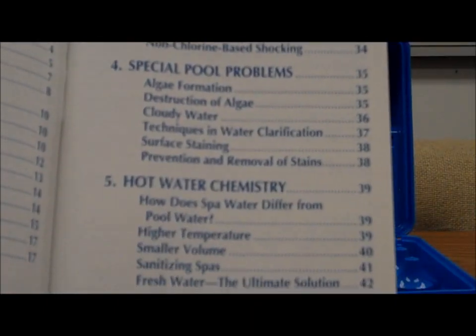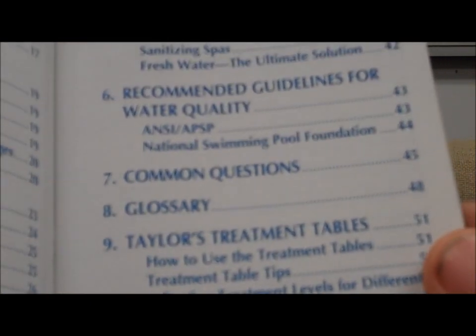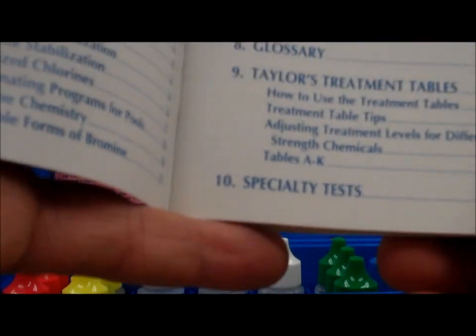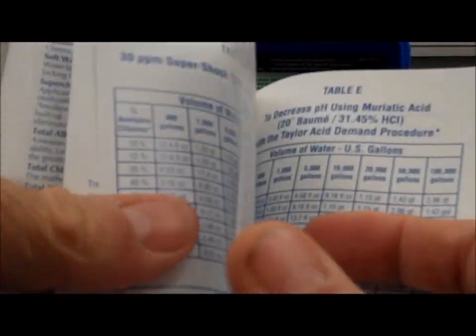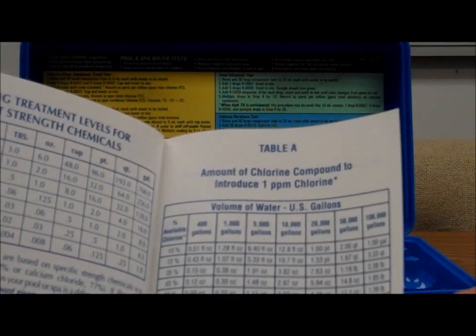The handbook covers special pool problems, a glossary, and common FAQ-type questions. Probably the most helpful and most-referenced part of this book are the tables in the back.